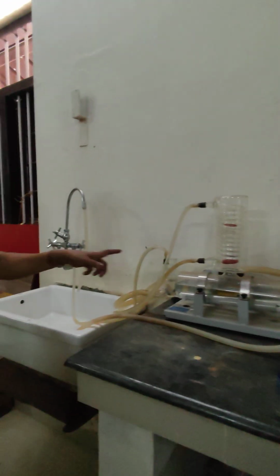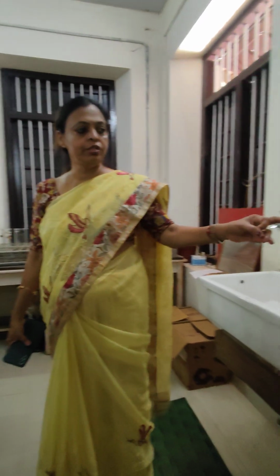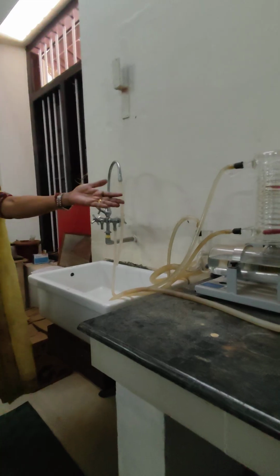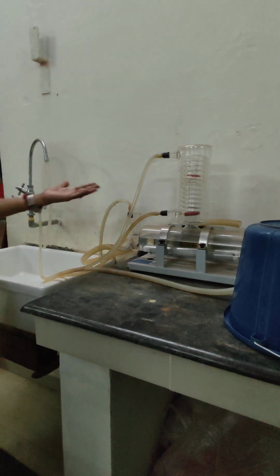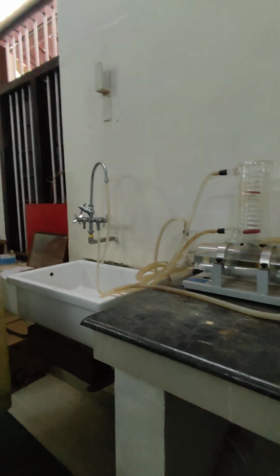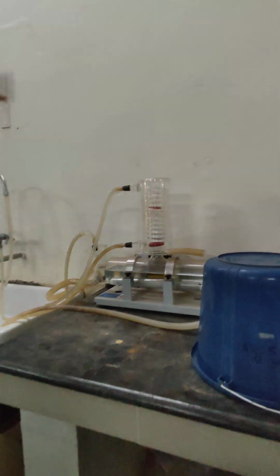This one is the distillation unit, for double distillation. We always use distilled water in the laboratories, and for this purpose we are using the distillation set. The ordinary water will enter into it and be boiled, and the vapors will be condensed and collected. So there is a single distillation unit and a double distillation unit. This is also very important in a laboratory.